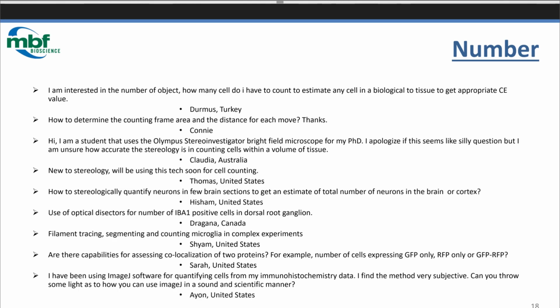Those 2 CEs are there to differentiate between situations where you have a smooth transition between your cross-sections, like maybe the amygdala, where the cross-section would be small, get bigger at the equator, and then get smaller as you section all the way through it. You'd use the less stringent Gunderson CE for that. If you're in something like CA1 of the hippocampus, your cross-sections are going to be big and then small and then big and then medium size and then big. For that, it's the more stringent CE we want to use for the Gunderson CE.